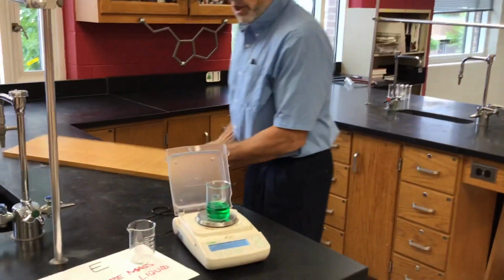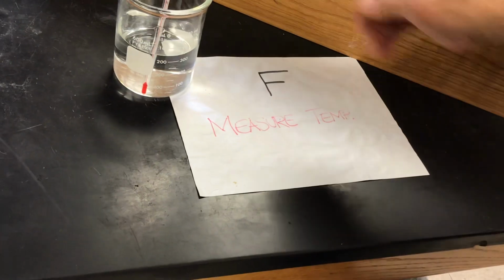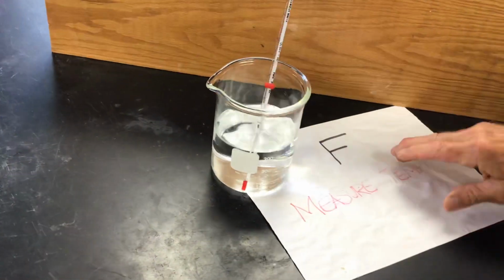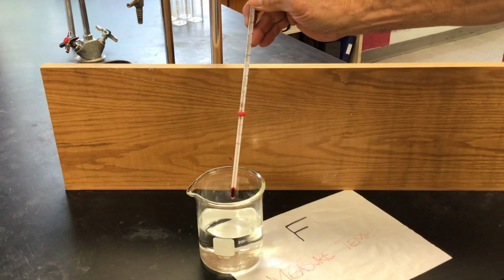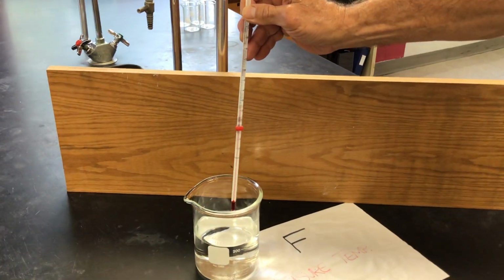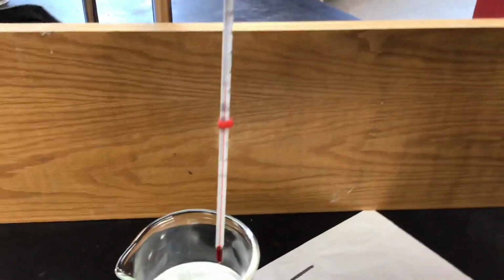One final station. It's not uncommon for us to have to read temperature. I don't know if we'll need the board. But this station F is simply saying, can you measure the temperature? So here's one of our standard thermometers. Can we see it? Yeah, I can see it fine. Looks like there's a red liquid in it. I thought thermometers had mercury. Is that a mercury thermometer?